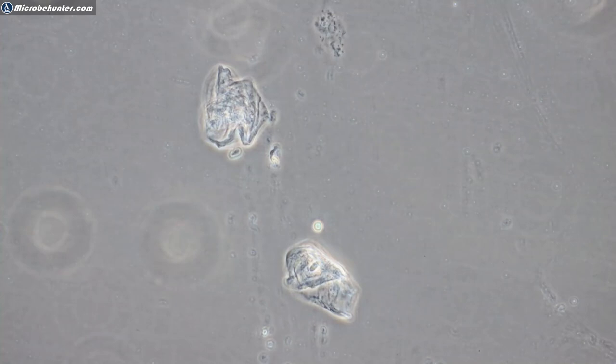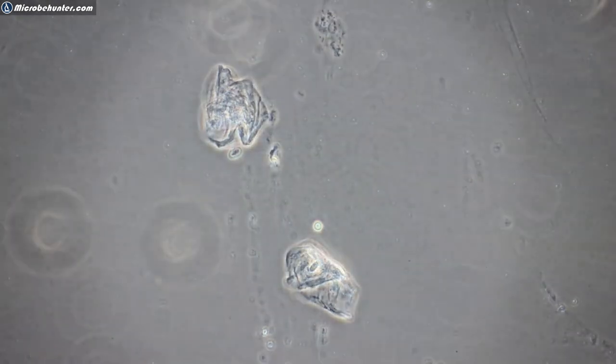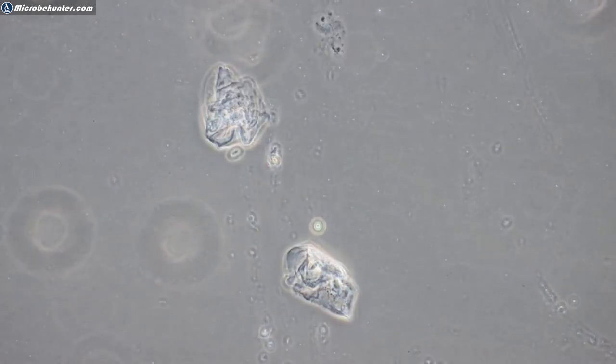I'm closing the condenser up. That was too much. Closing the condenser a little bit too much. Now I'm closing also the Köhler diaphragm, the field diaphragm. You open it a little bit more. Okay. So yeah, so these are basically a couple of skin cells.